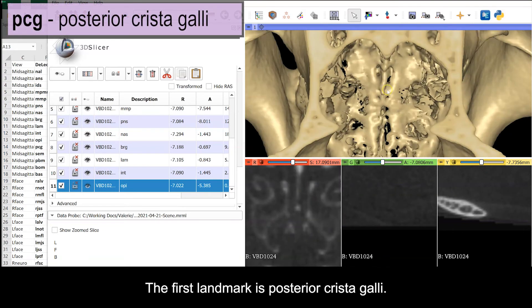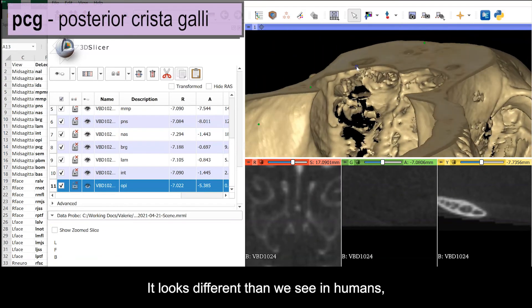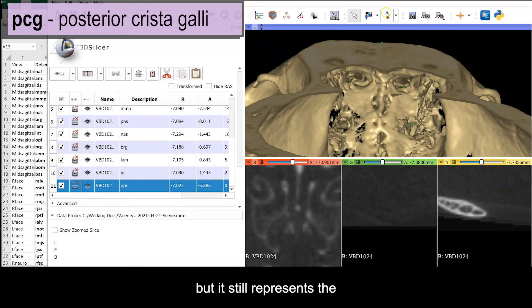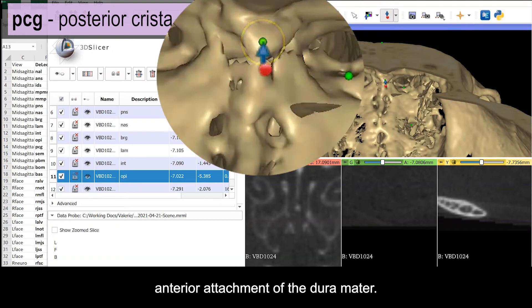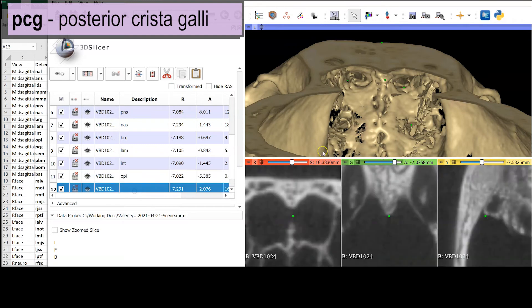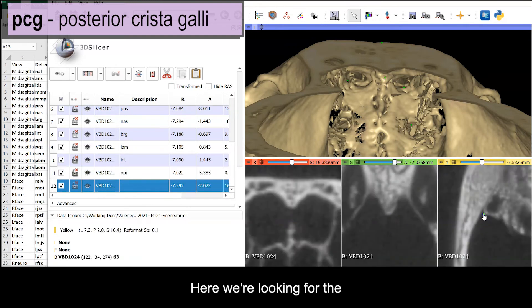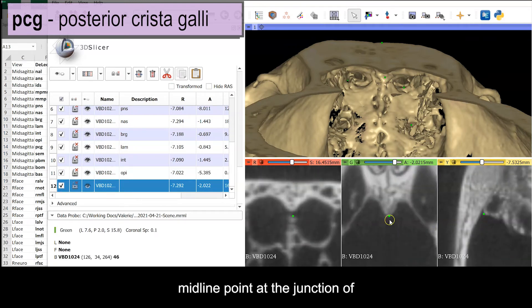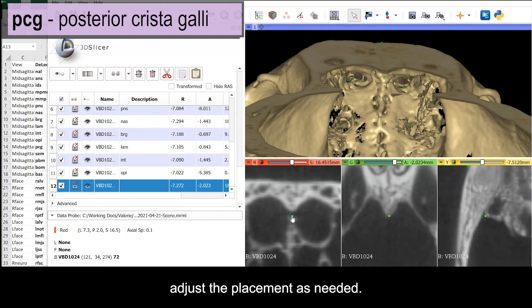The first landmark is posterior cristal galley. It looks different than we see in humans, but it still represents the attachment of the dura mater. Here we're looking for the midline point at the junction of the ethmoid and the frontal. Use your orthogonal views to adjust the placement as needed.